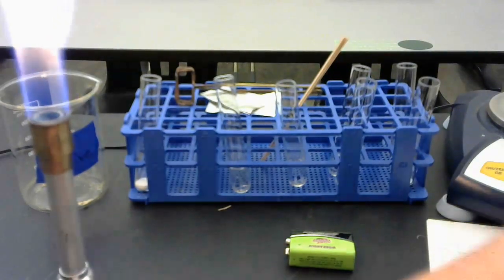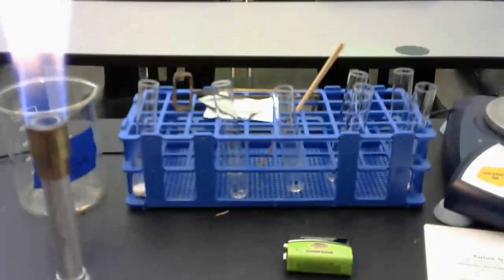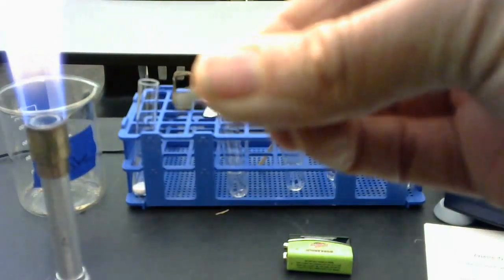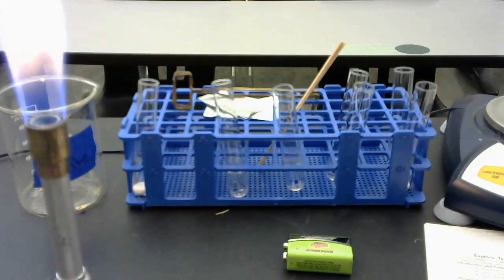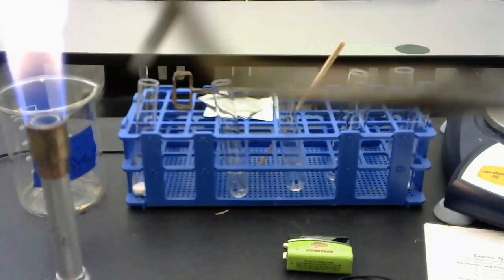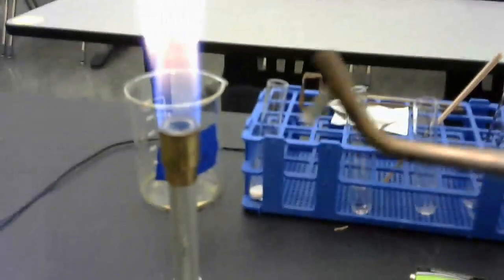Magnesium is Mg. My piece of magnesium is just a little silver piece in my hand. It's kind of hard to see. I'm going to put that on my crucible tongs, just like this, and then I'm going to hold that into my flame.